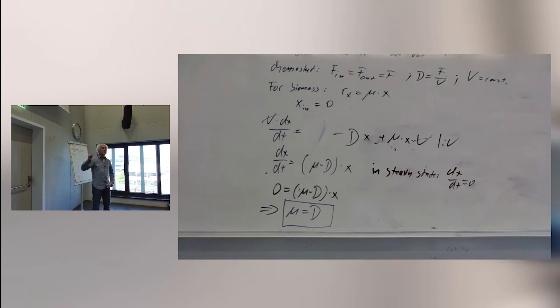So in other words, what I can do is adjust growth rates in a chemostat. By increasing or decreasing the flow rate of my pump, I can adjust a biological parameter, a specific growth rate. Of course, if I change it, so if I go up to a higher dilution rate, there will be some time until this is no more a steady state.